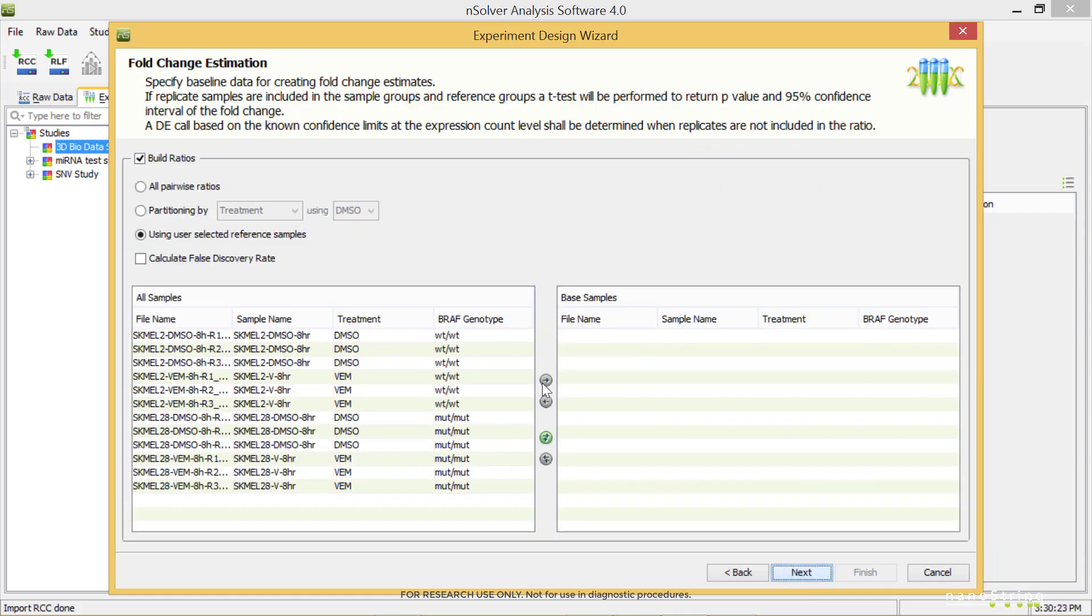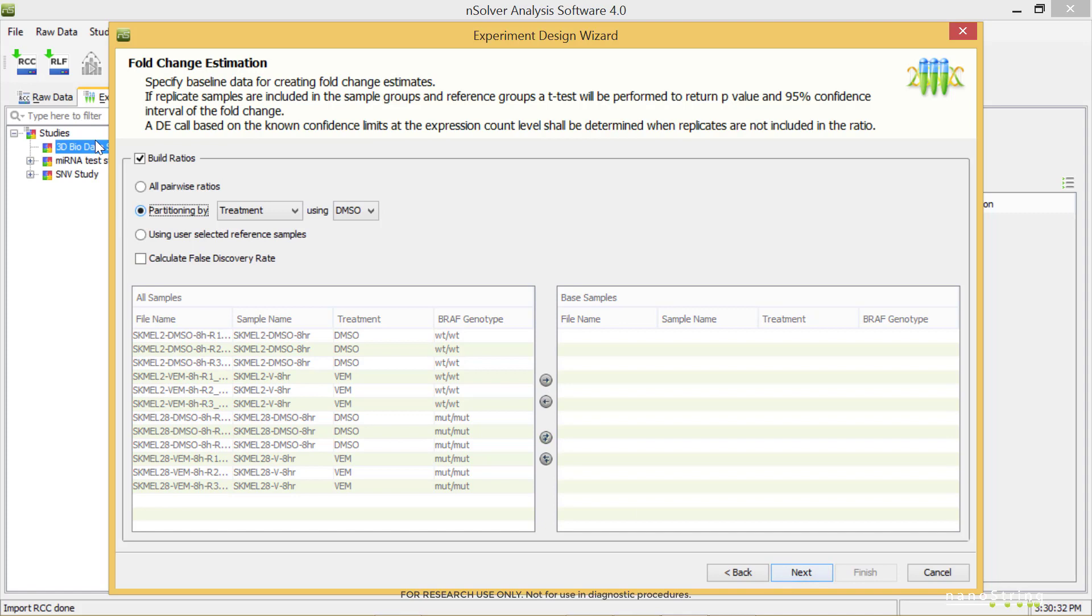In creating ratios, we have a couple of different options. For this example, we'll select Partitioning By. It will default to one of the annotations we entered earlier, Treatment, and we'll choose a treatment type as a reference, in this case DMSO. For this example, we'll keep these defaults, but they can be changed using the drop-down menus if desired. You can use the checkbox to calculate the False Discovery Rate, or FDR. Select Next.